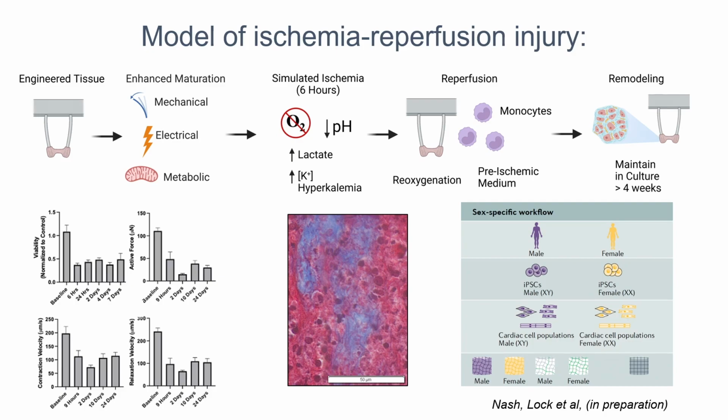What do we do with this muscle? We obviously use it to study toxicity because cardiac toxicity is responsible for about 1/3 of all cases of toxicity that is observed clinically. But we also use this heart muscle to study different diseases, genetic diseases, and also injury. And the example that I show you here is a model that we recently established. This is still work in progress, still not published. It's a model of ischemia reperfusion injury. In simple English, this is what happens following myocardial infarction.